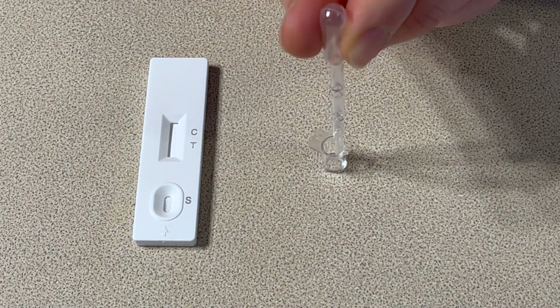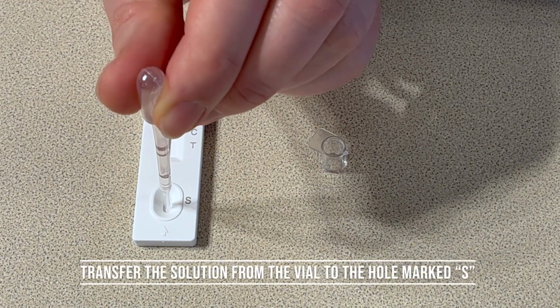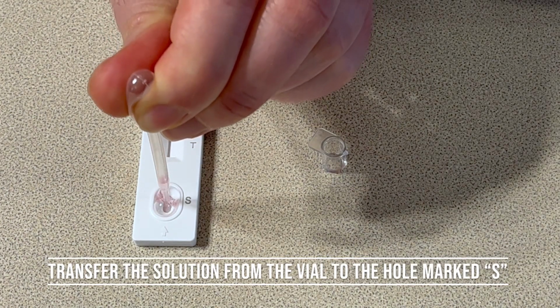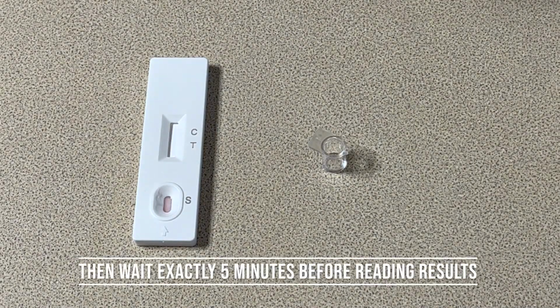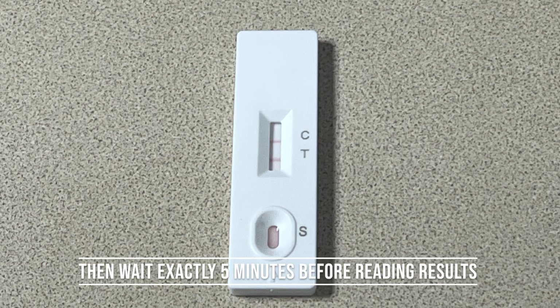After the 2 minutes are over, transfer all of the solution from the microvial into the sample hole of the cassette, marked with the letter S. Then, wait exactly 5 minutes.